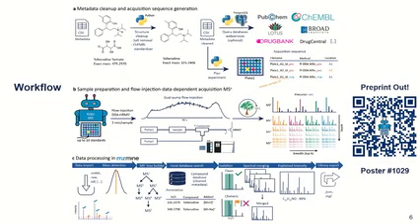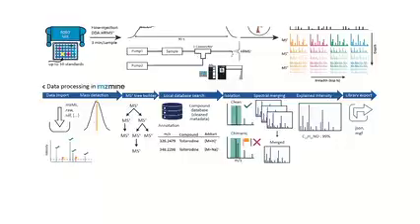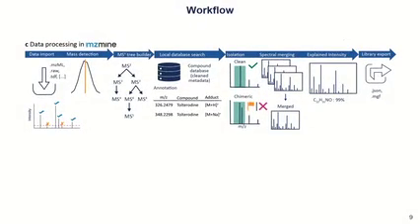And then we have our data processing in MZmine, and this I will show a bit more in detail. The import and mass detection is everything that you basically did now during the hands-on session. We have then, in this case, the MSn tree builder, but it's only because we have no retention time. If you have liquid chromatography, again, it's the steps that you did today in the workshop because we need to have the feature table that you just generated.